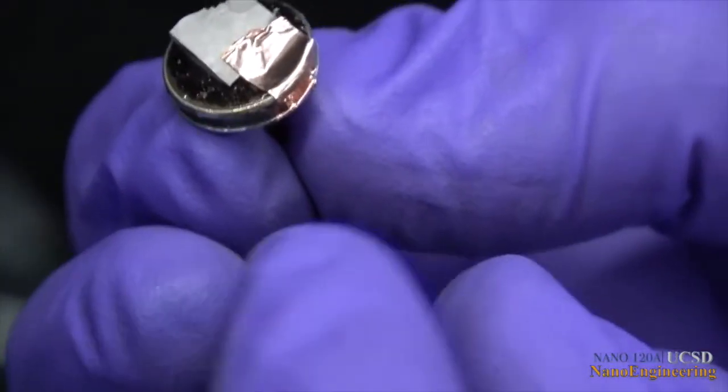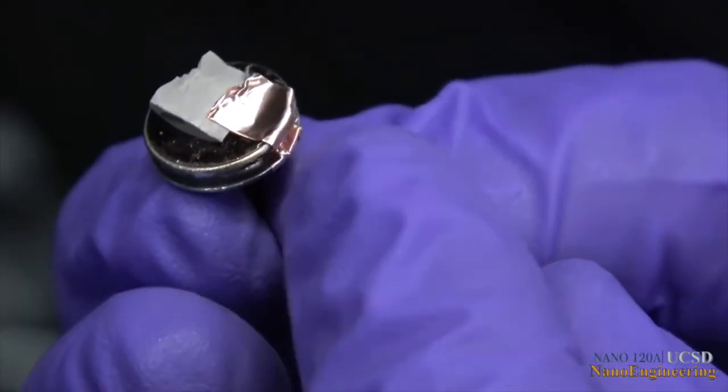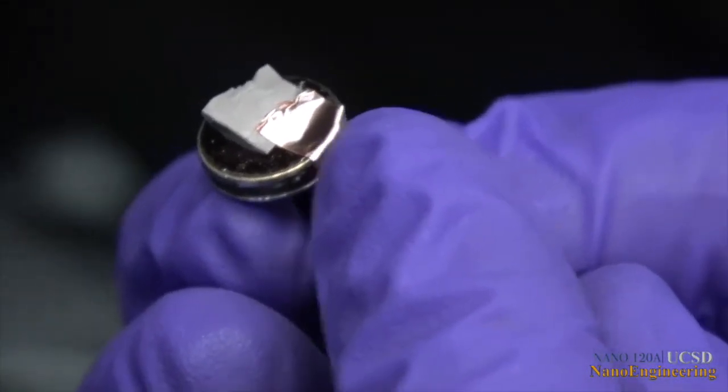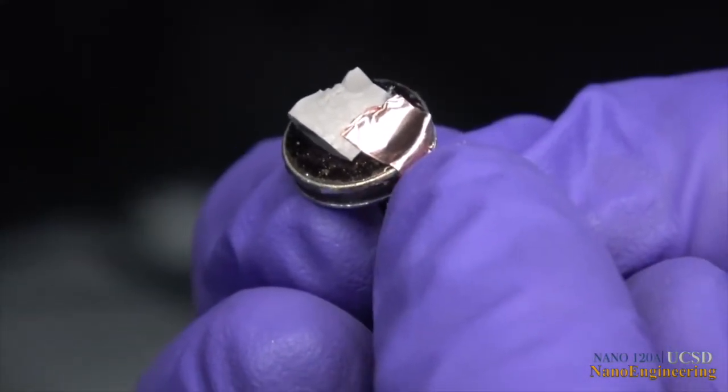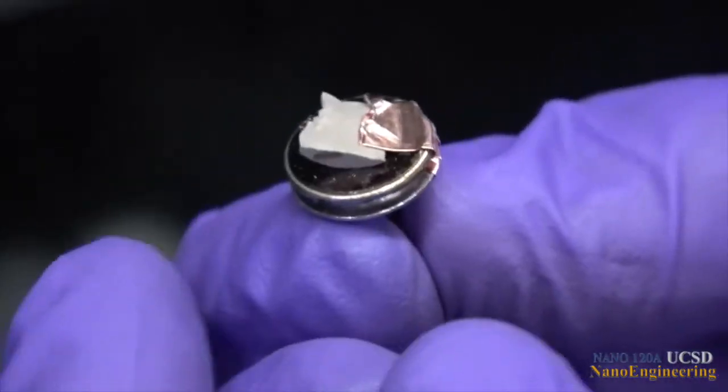Non-electrically conductive materials should always be prepared in a similar manner, since the inability of electrons to conduct away from the sample can cause charging of the specimen and interference with imaging.